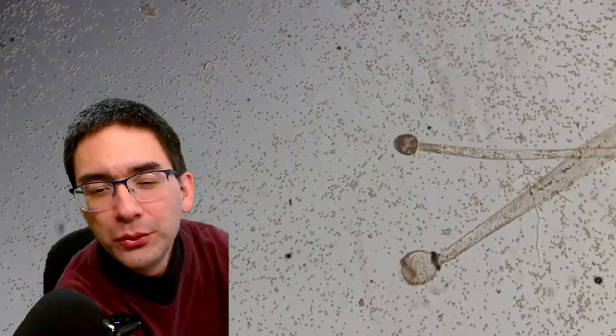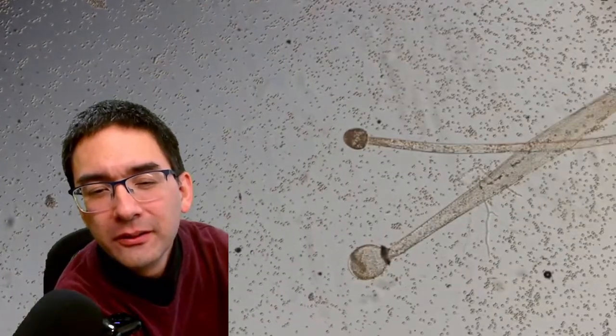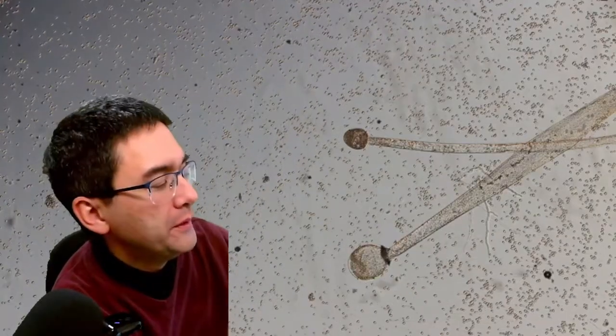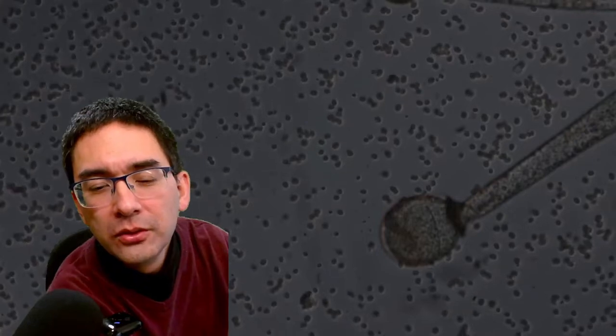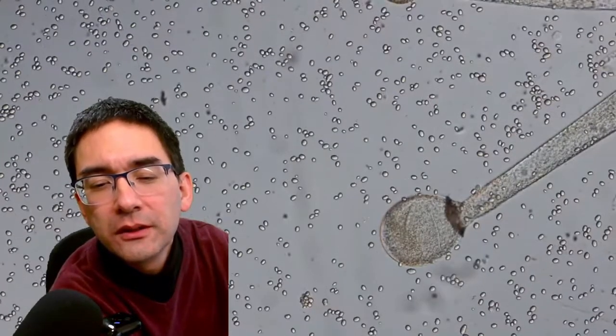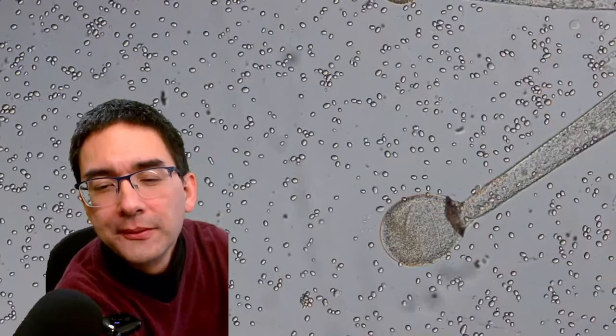Could this be one of these fruiting bodies? Basically the spores are formed in these round bulb-like structures. And then when they pop open they release those spores. Here we go. Need to make it a little bit brighter. Here we go.